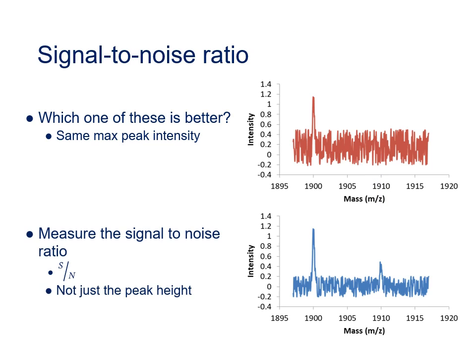This is why we often describe peaks in mass spectrometry not by their absolute intensity, but by how much bigger than the noise they are. And we call this measure the signal-to-noise ratio. As the S/N symbol suggests, to calculate the signal-to-noise ratio, you divide the signal intensity by the noise intensity. By considering the spectral quality in this way, the bottom spectrum has a signal-to-noise ratio twice as high as the top spectrum, and that explains why we can see that second, smaller peak.